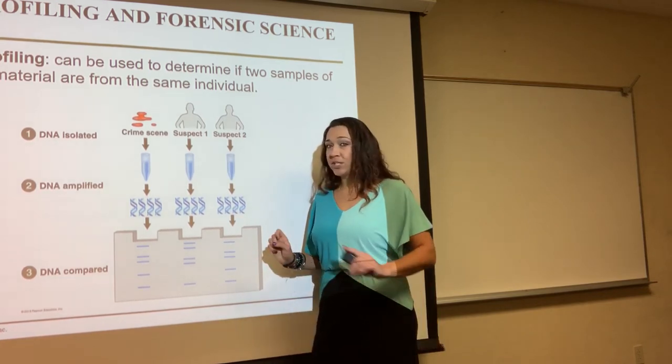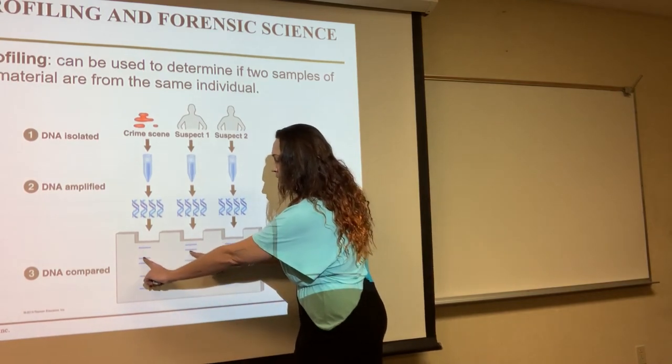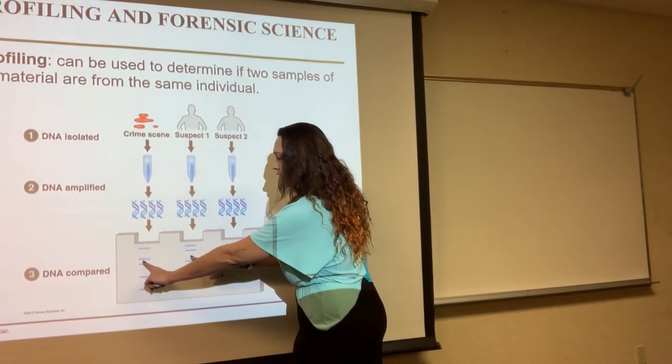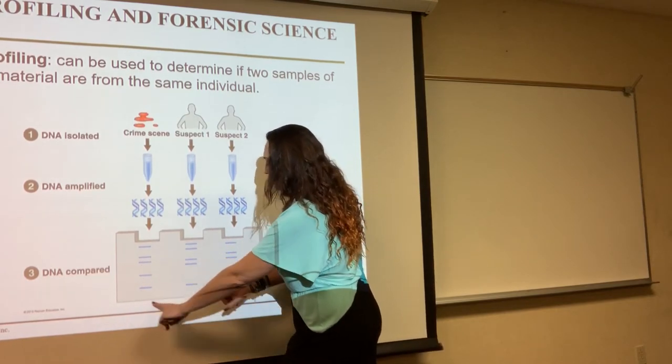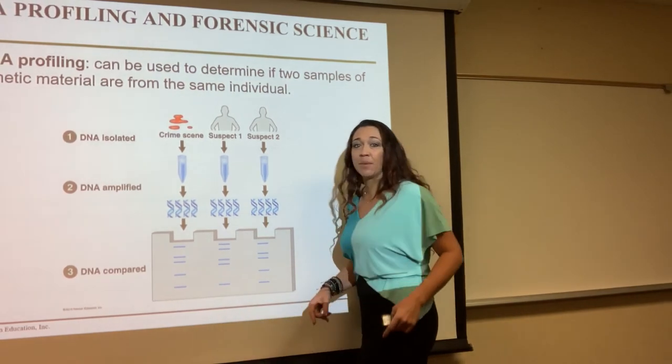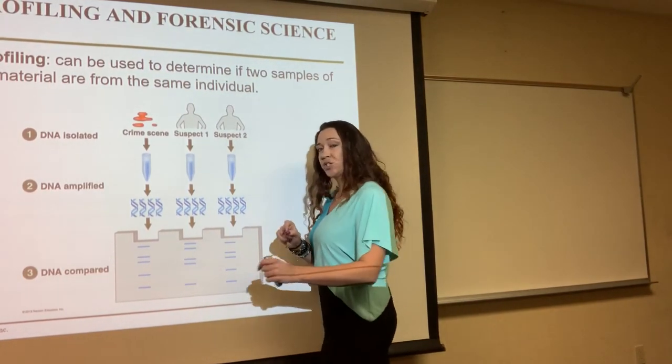All we have to do is compare the two. Let's look at suspect one. Yes, he's got the first one. Oh, he doesn't have the second one. That one matches up, but that one doesn't, and that one doesn't match up. Only this bottom one down here matches up. So it looks like suspect one is in the clear. He didn't do it.